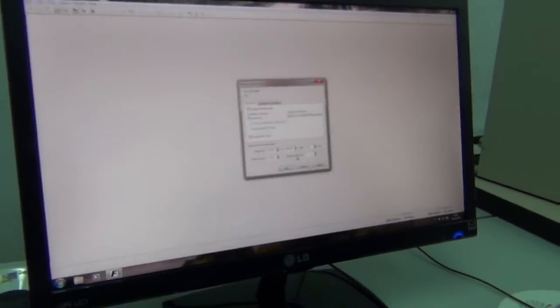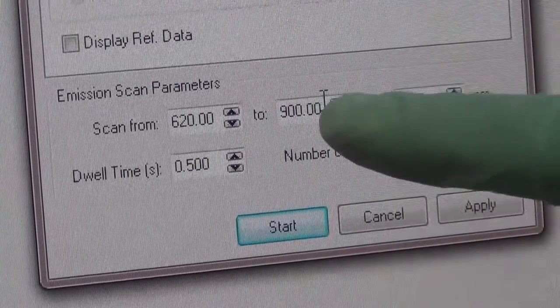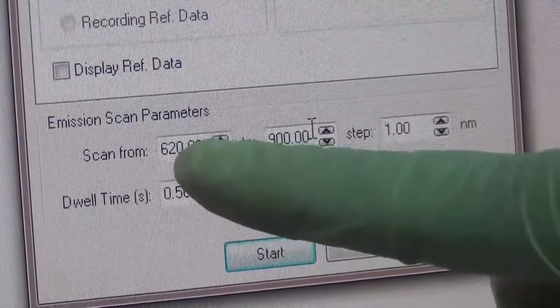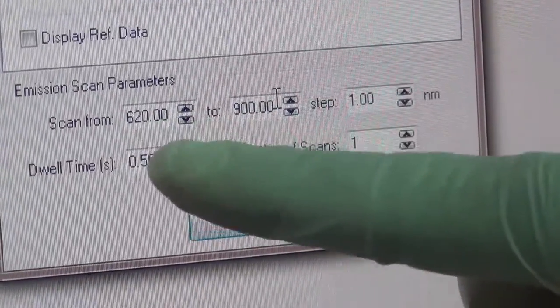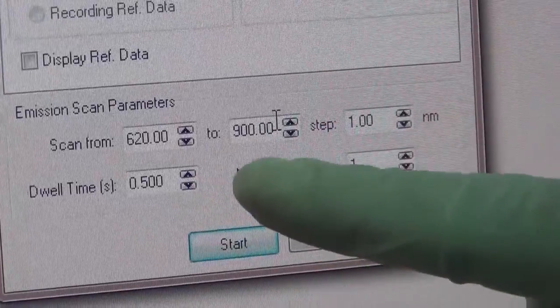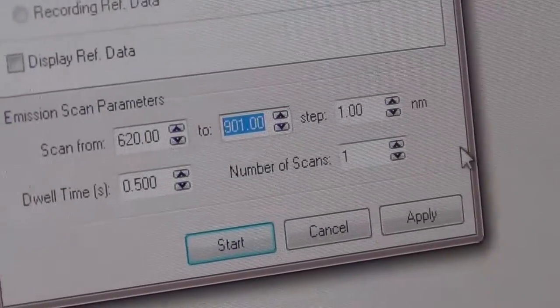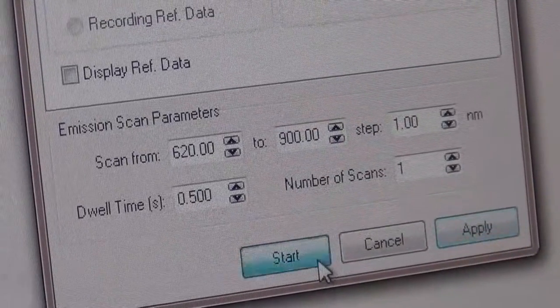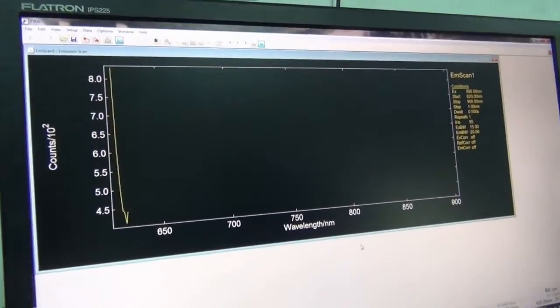So again, click the lambda button, emission scan. So 620 is okay until less than 2 times lambda. This is the starting lambda. Absorb lambda. So 600 times 2 is 1200. We could not use 1200 over here because the maximum limit is 900. So just put 900. Apply, and you could start your measurement. Let it be like that.